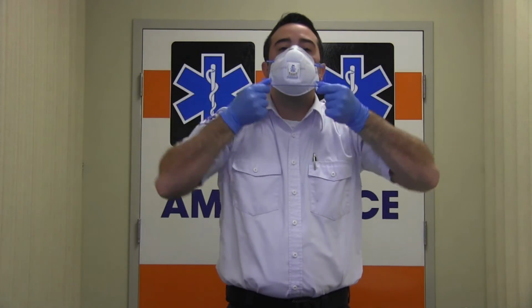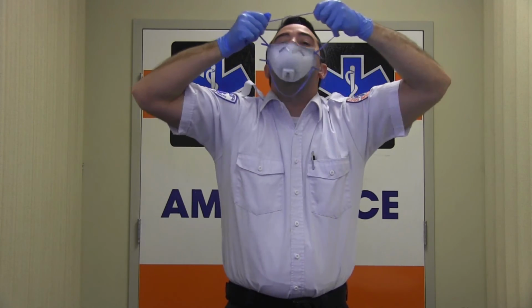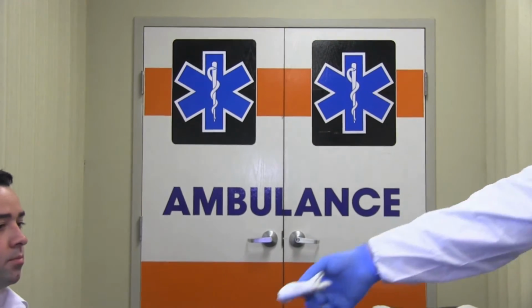Now you will remove your N95 respirator by tilting your head slightly forward, grasping first the bottom tie, and then the top tie, and removing the mask without touching the front of the respirator. Discard the N95 respirator. Again, you will disinfect your gloves with an alcohol-based hand rub.